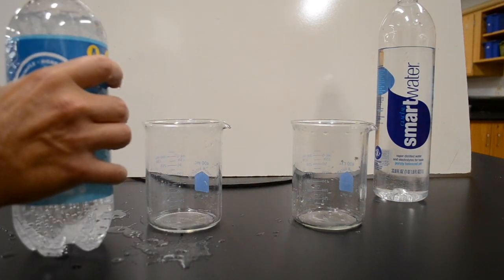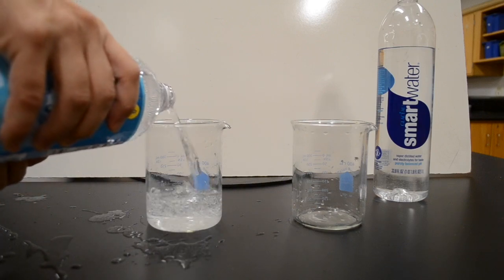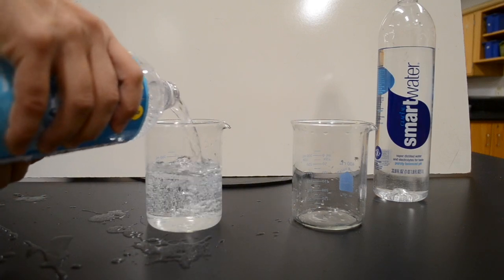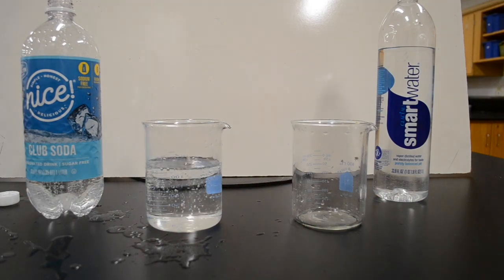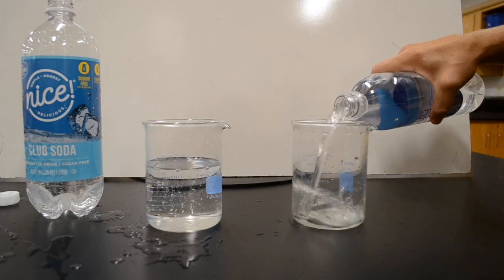Whoa, see it's shaking everywhere? It's like a pop. Okay, we're going to add 300 milliliters of this to the first beaker. And then we are going to add 300 milliliters of regular water to the other beaker.